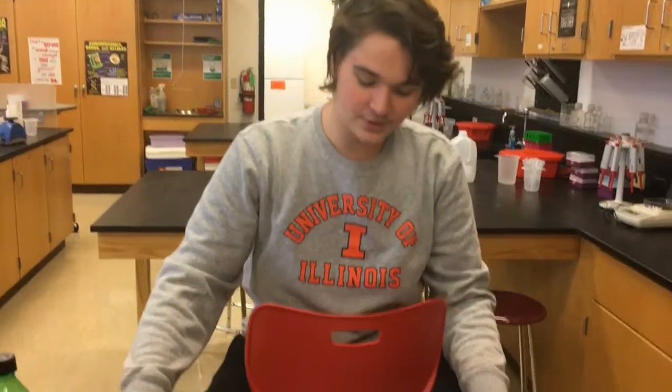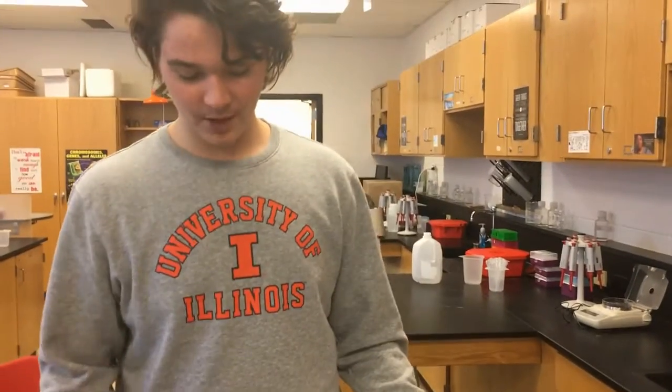Alright, so I'm going to show you guys how you can use this in real-world applications. Alright, so I'm going to show you about comparing same DNA with different restriction enzymes and then comparing different DNA with the same enzymes.